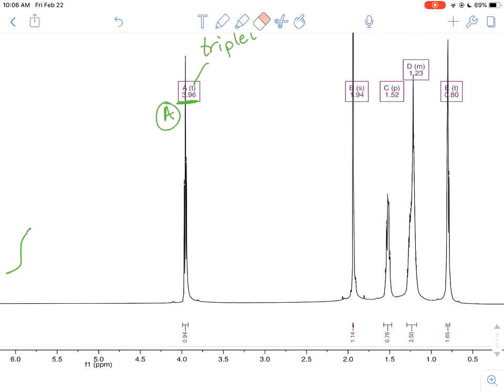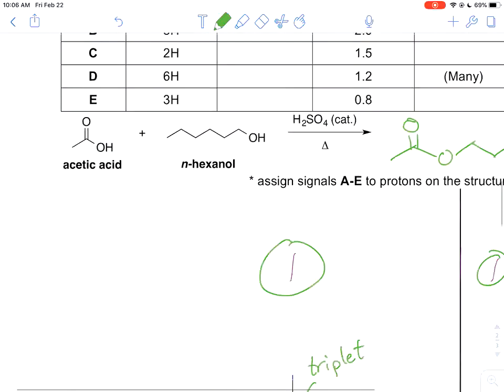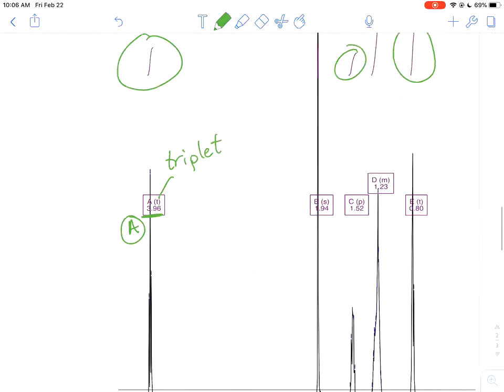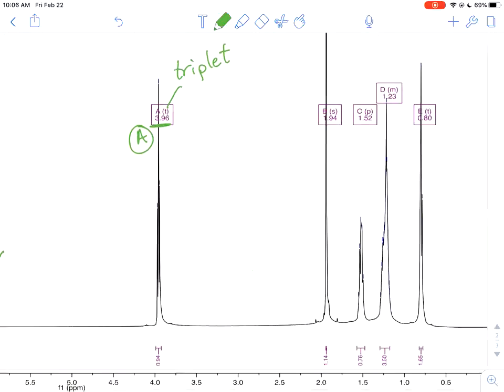And I wanted to show you an example of kind of a bad integration. This is why I give you the number of hydrogens up here because I know that it is a little bit wonky. So this is already filled out for you. But I think it's important, especially for those of you that are moving on for more NMR applications to know what's going on here. So what we should be doing is looking at these individual numbers. And these are going to give us relative ratios, in this case pretty loose ratios of who goes with what. And we're going to take the smallest number, divide in this case by 0.76 on each, and get a relative idea of how many signals or how many protons each signal is worth.